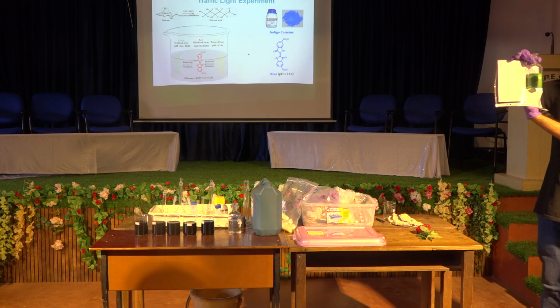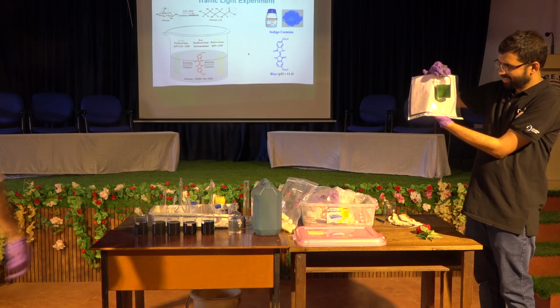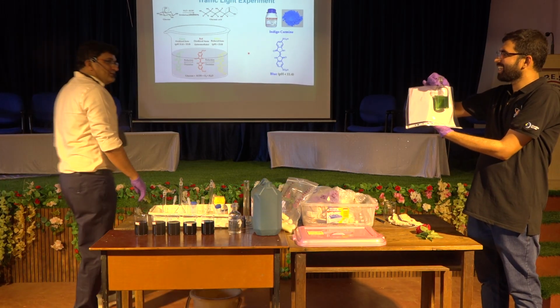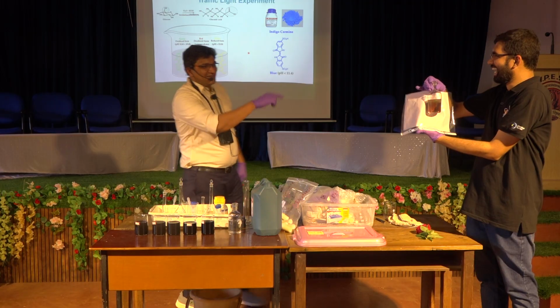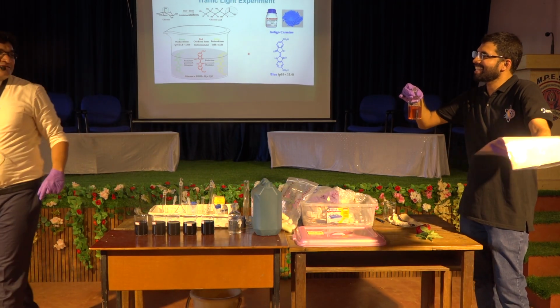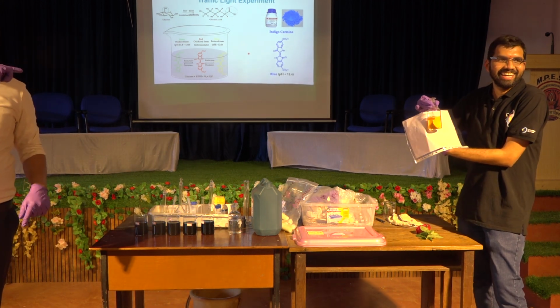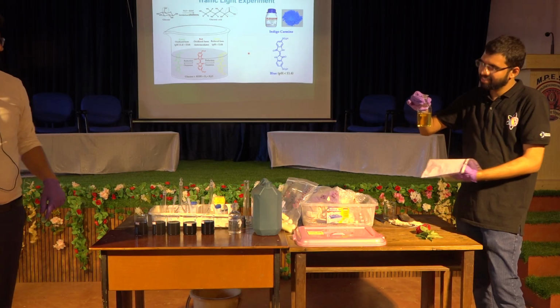Which color is this? Green, right? Okay, wait for a moment. So these guys are light, sir. That's not green. Don't shake, don't shake. Oh, this is not green. This is a different color. Are you sure you said the correct color in the previous instance? Don't shake. It will turn into yellow again.